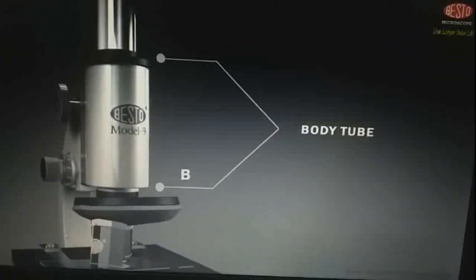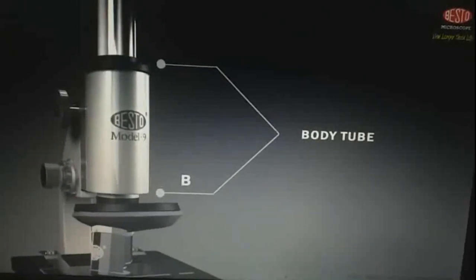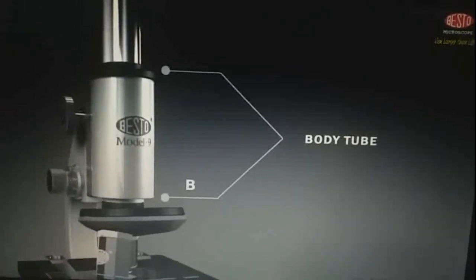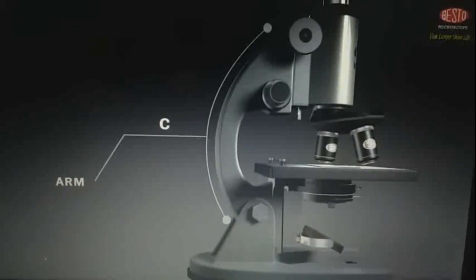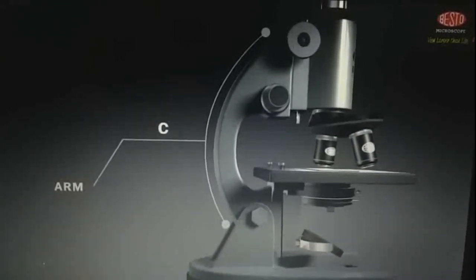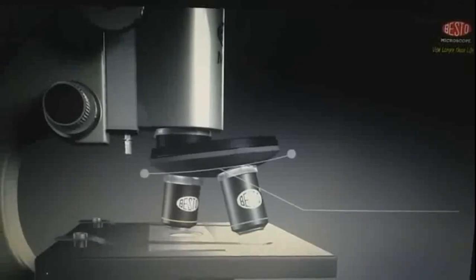B, body tube. It holds eyepiece in position over the revolving nose piece and the objectives. C, arm. It is curved metal piece that holds the body tube in place over the stage and the base.